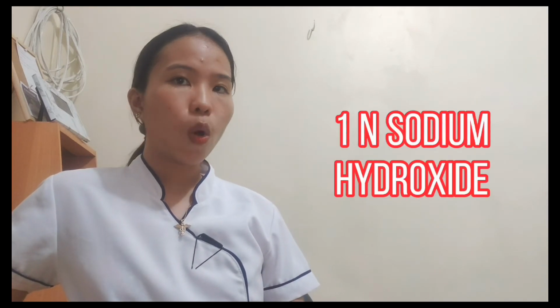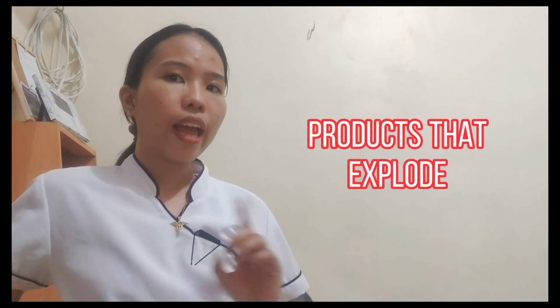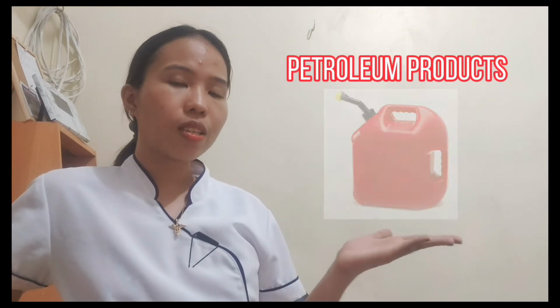Lastly po, we have the 1N sodium hydroxide, which is used to produce soaps, rayon, paper, products that explode, and petroleum products. And that's our discussion about the reagents of boric acid.